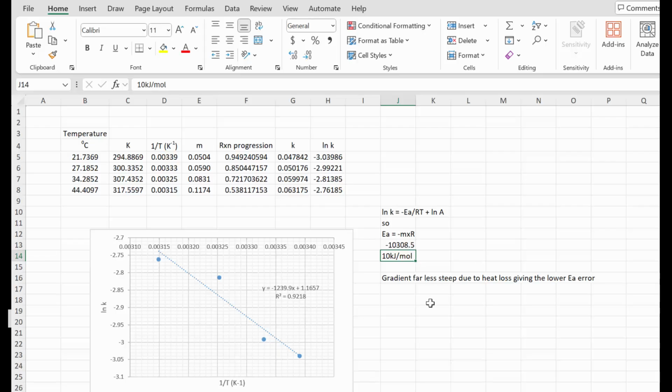So it's a pretty simple experiment, very quick and easy. Like it a lot. Definitely think this is the way to go. I think that particular experiment loses so much heat it's not funny, and so at least he put the assumptions in there and he did get a good result. I'm not quite sure how he avoided all the heat loss. So fantastic experiment. Do it with something else that's not going to have so many violations of the assumptions.